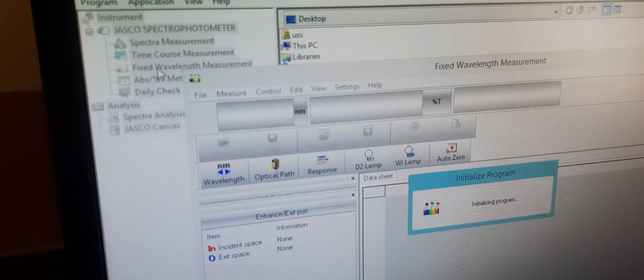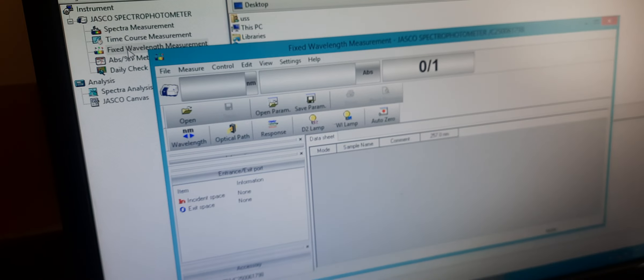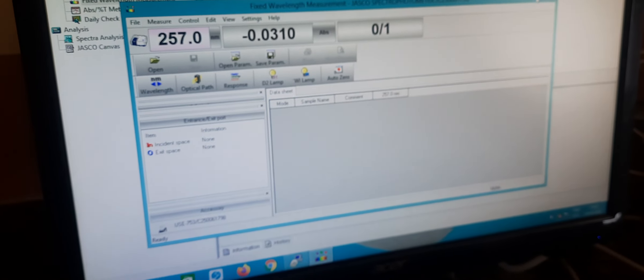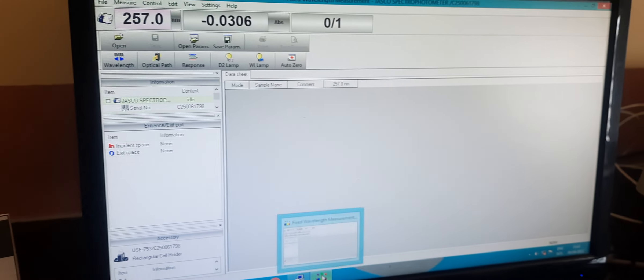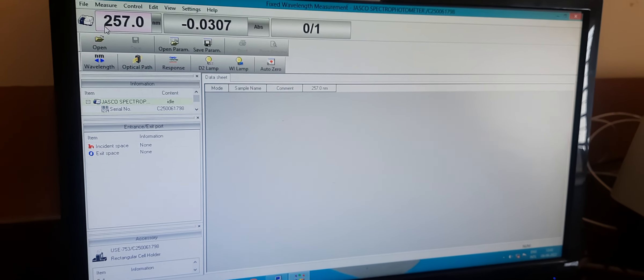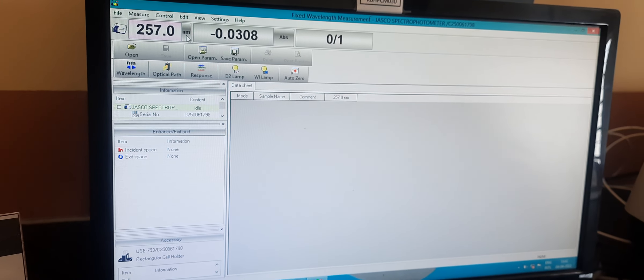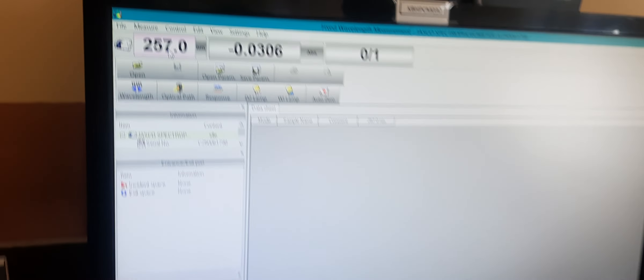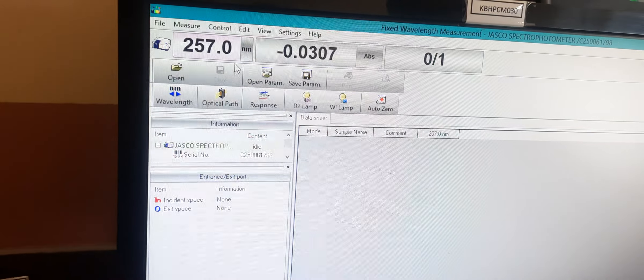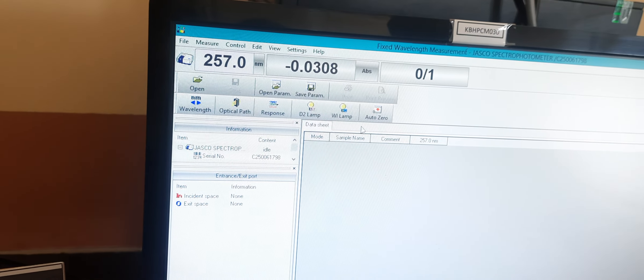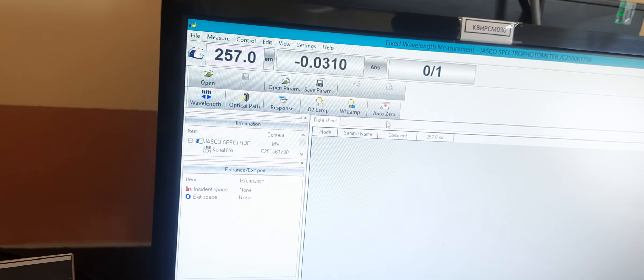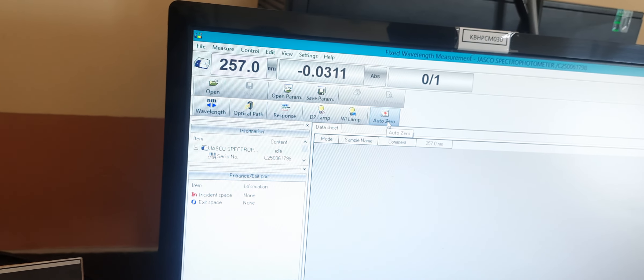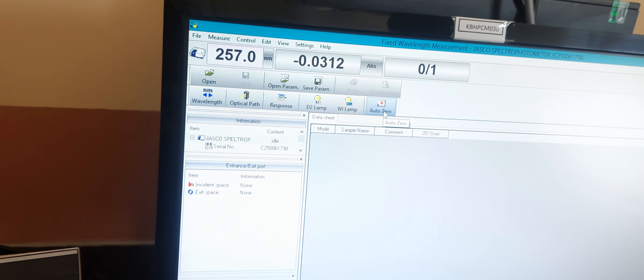Just double-click on the fixed wavelength measurement tab. After that, the window opens. Here we can see the nanometer, absorbance, and other parameters. First, we have to do the baseline correction.